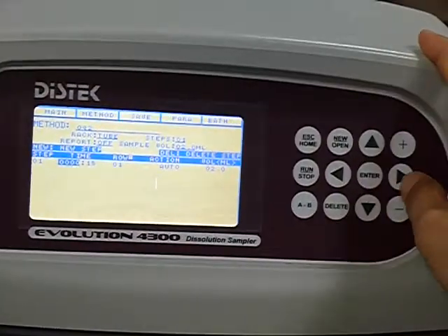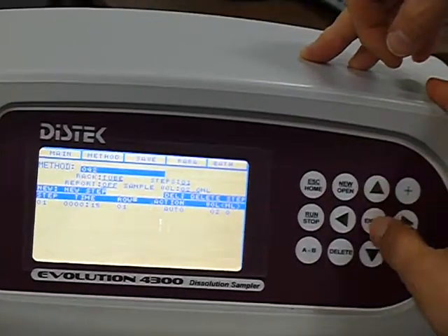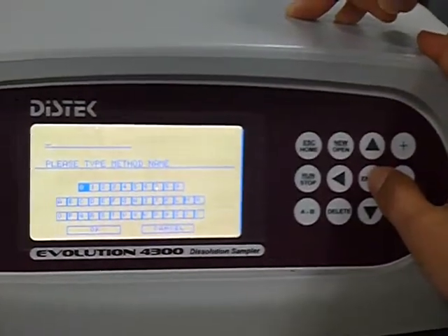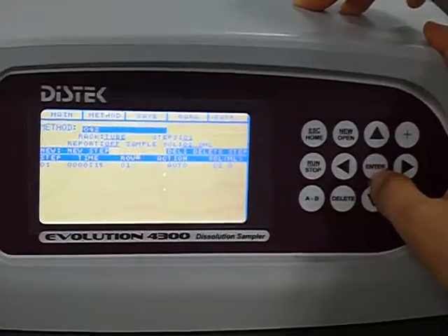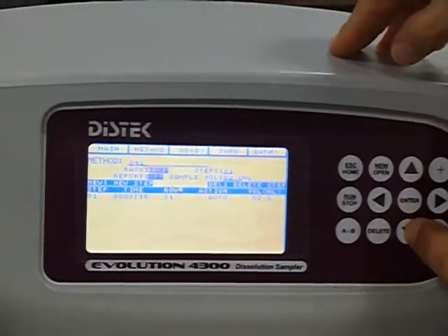Where is this report? Report is right under. Let's go back down to. Oh, here no. Go down to cancel. Okay. So you're down, tube. Report if there is a printer. Okay, we don't have a printer.